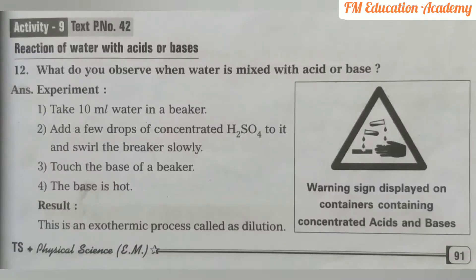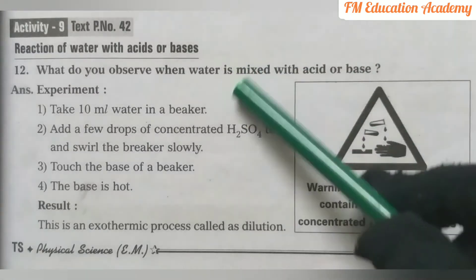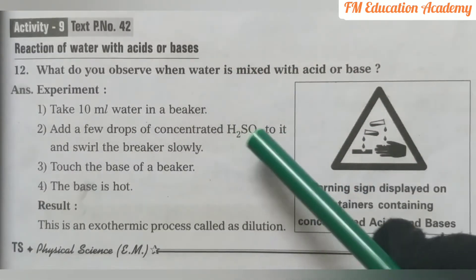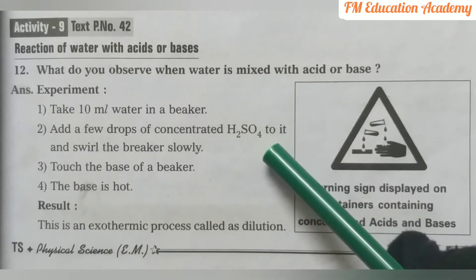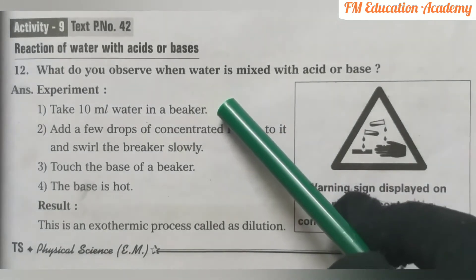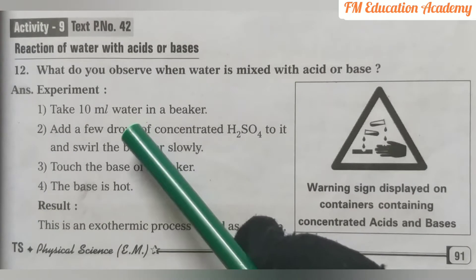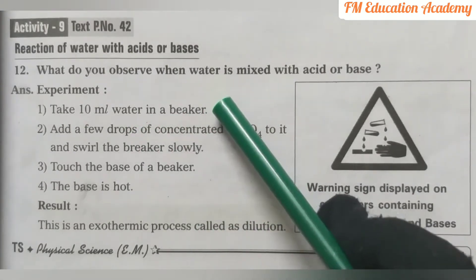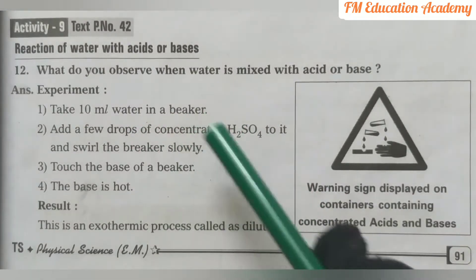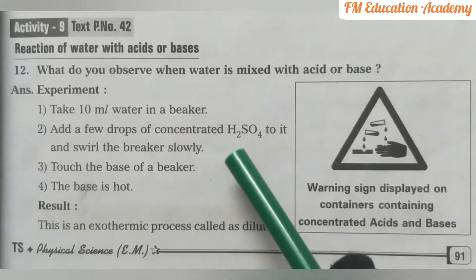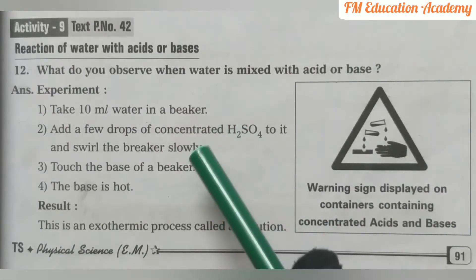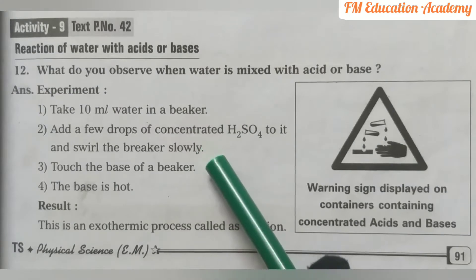The procedure is: we are taking about 10 ml of water in a beaker, and then we are adding just a few drops of concentrated sulfuric acid to the beaker. Then we slowly mix the beaker. After some time, we can observe that the base of the beaker has become hot.